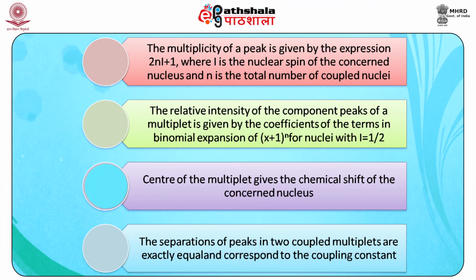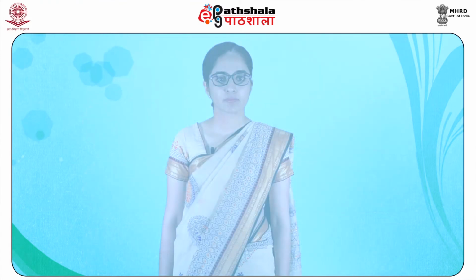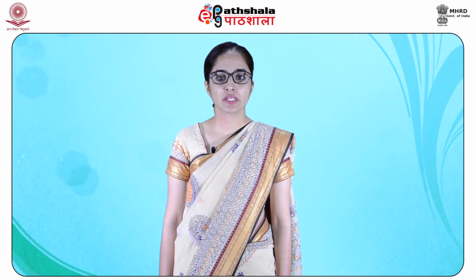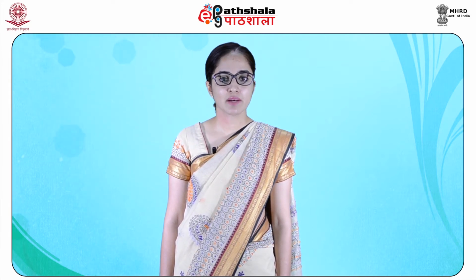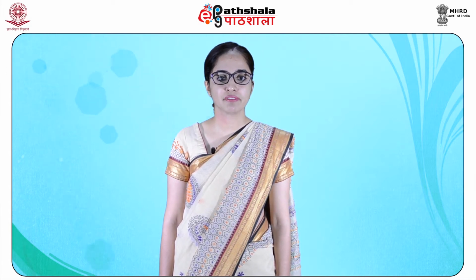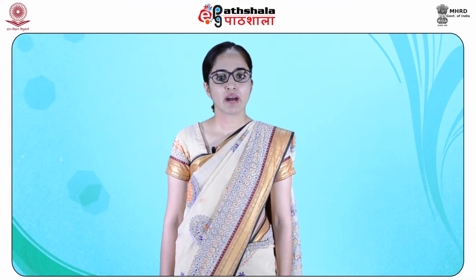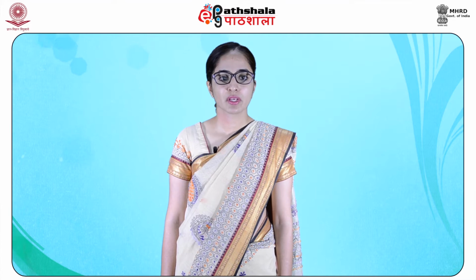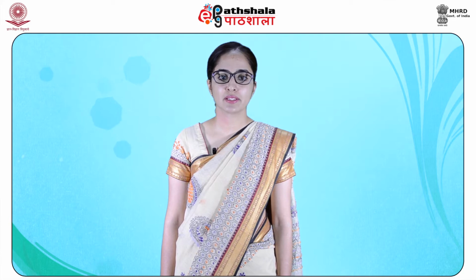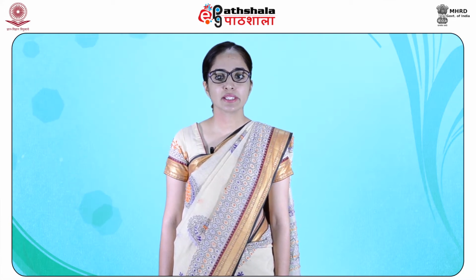The last and the fourth point, students, is that the separations of peaks in two coupled multiplets are exactly equal and correspond to the coupling constant. Now, it is well known that the chemical shift measured in Hertz depends on the applied magnetic field, and the value of delta nu increases as the field strength increases. The value of coupling constant J remains constant, and hence the value of delta nu divided by J will increase on increasing the field strength.